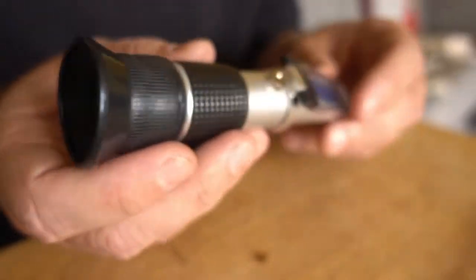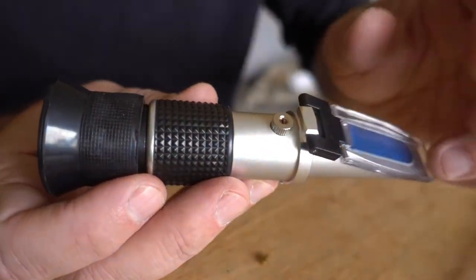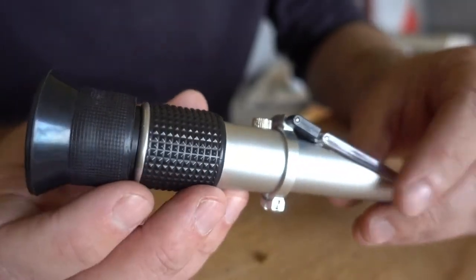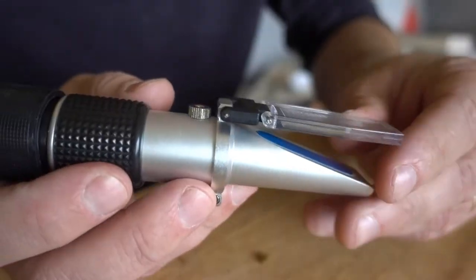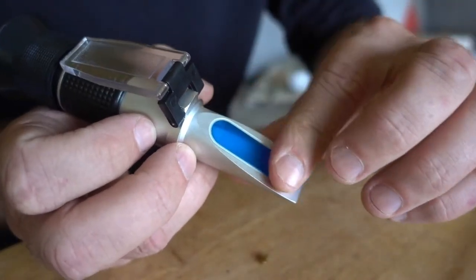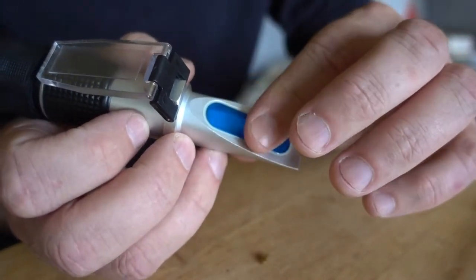So what we got here is a refractometer. It's sort of a portable microscope that we use to determine the moisture content of the honey that we've harvested from our bees.